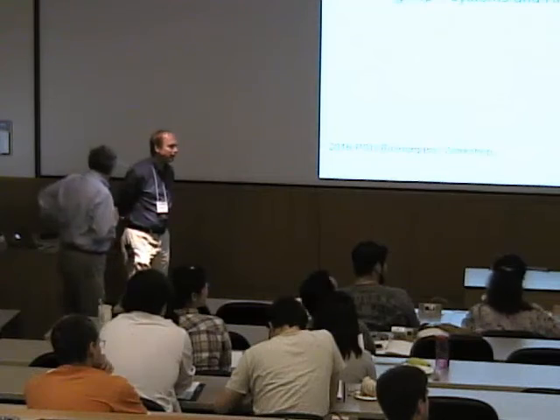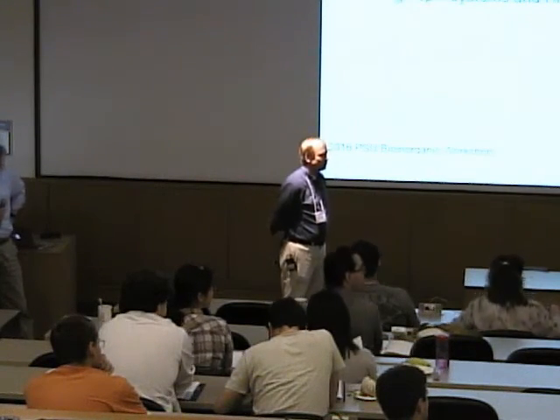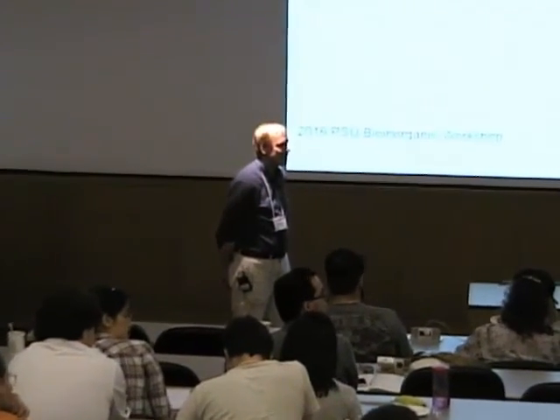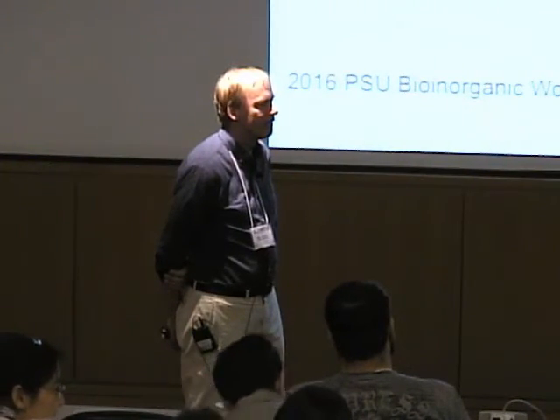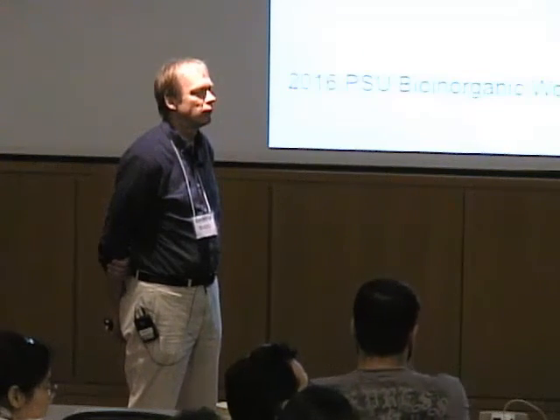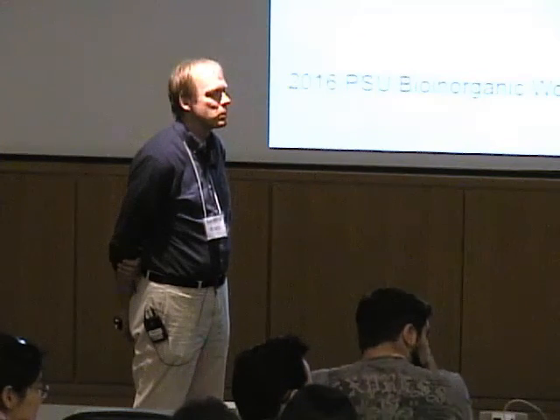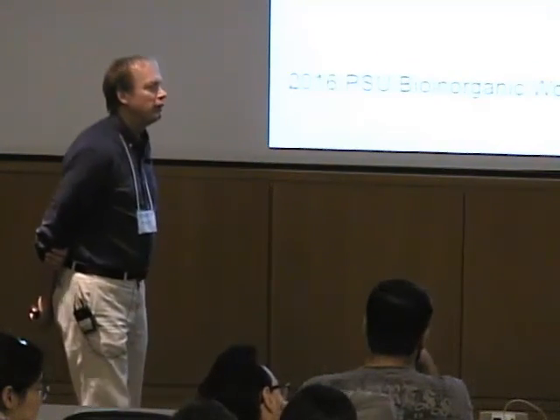Marty? Since you were looking so beautifully and clearly at the hardware, I'm wondering, is there a fundamentally different way to detect an EPR transition that would perhaps just be a game changer? I remember maybe 20 years ago now, a group at Emory was trying to use a squid susceptometer to detect EPR transitions. Is there anything else on the horizon that might come one time to replace it?